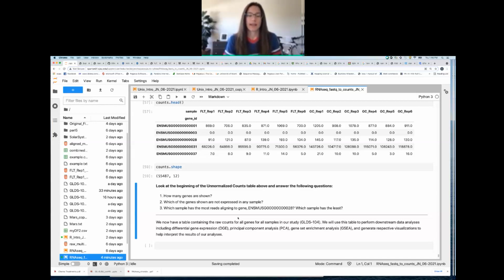So once it's reconciled, if a new gene is imported into a database, it's given that database's number. And so it would be an Ensembl number here. And then once it's figured out that there are two Ensembl numbers that represent actually the same gene, there will be a decision made for what gene name is going to be used moving forward.